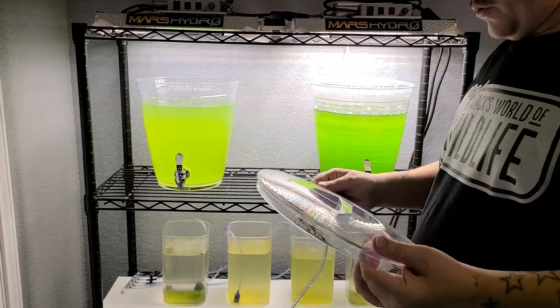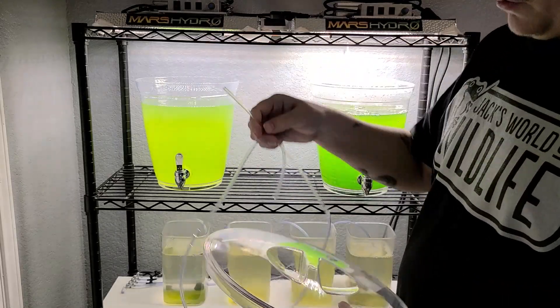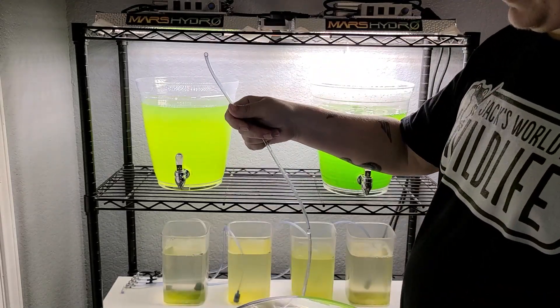Next up, all we have to do is put our rigid airline tubing through the lid and then hook this right back up to our air pump.